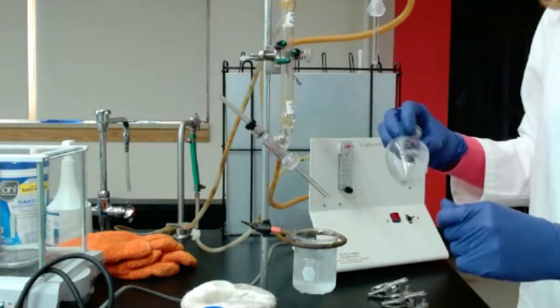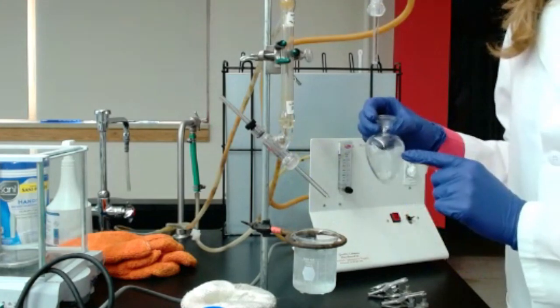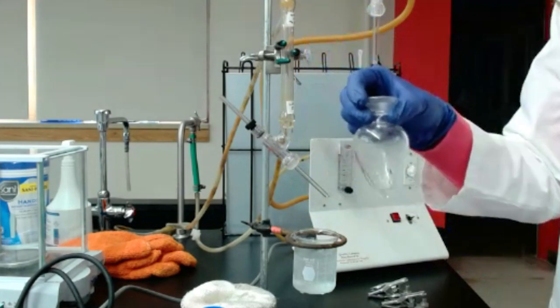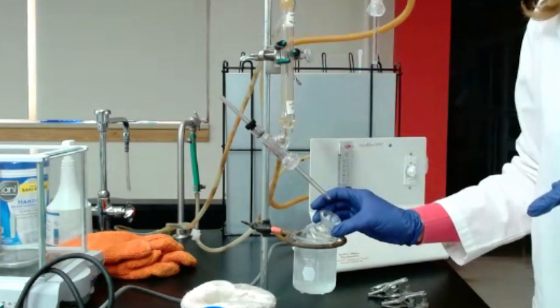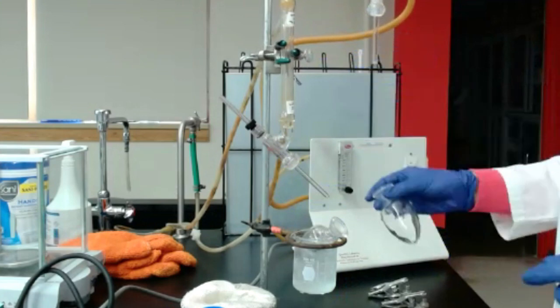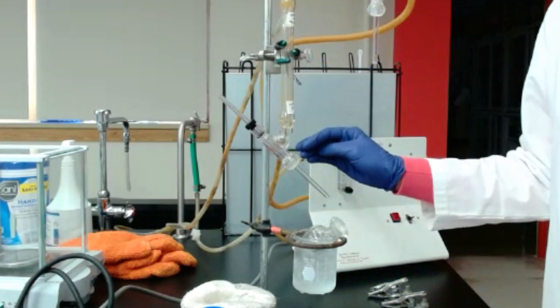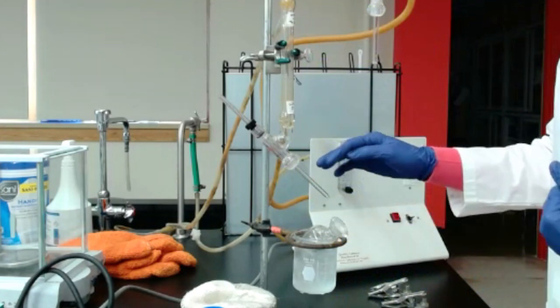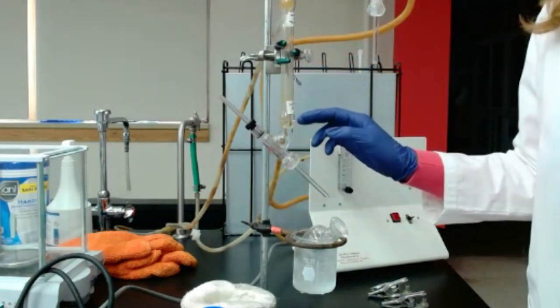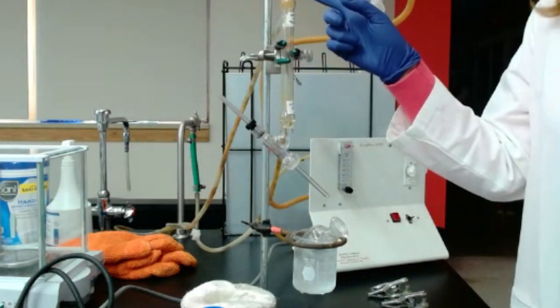So this flask, that's the G on your handout. G flask, that's where you're going to have your samples of wine that is going to be acidified. I just put G to make sure I remember where it's supposed to go, because you will have exactly the same flask to put on the top here. That's the D. So G will contain acidified wine. That's going to be connected to that empty tubing. That's also connected to a system where you have water that is going to go through. So water has to come in at the bottom and will go out at the top.